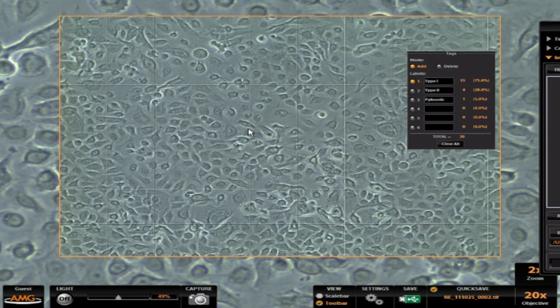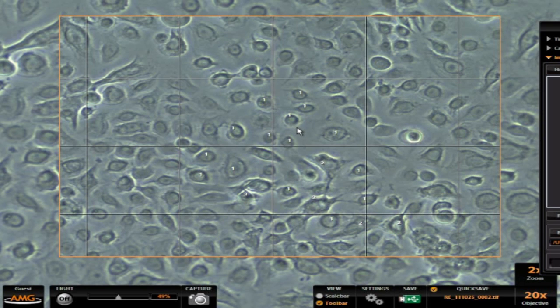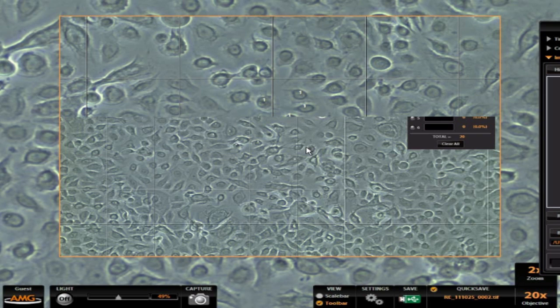And you can see that we've got all that information in here. I can zoom in like this. Here's my tagged cells in the grid and up here we've got the information about the counts. So it's all in a single file.